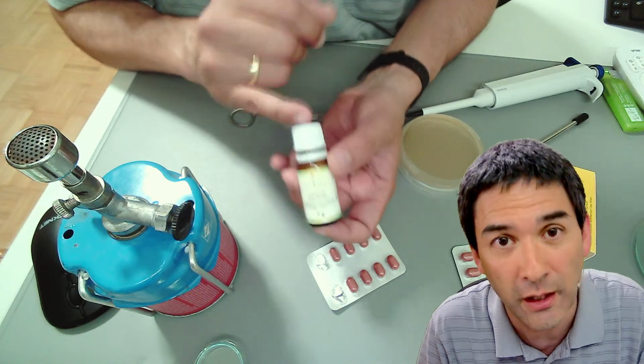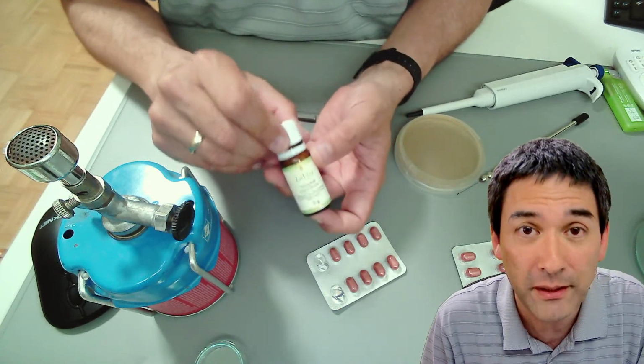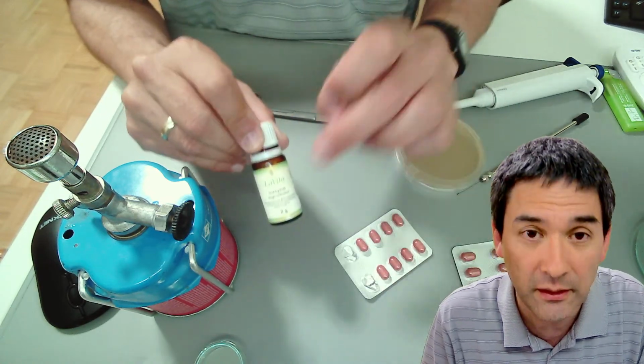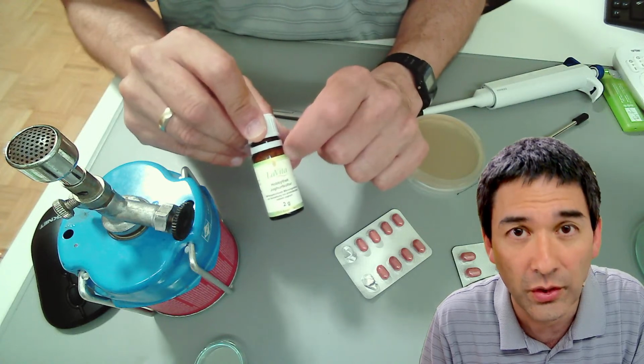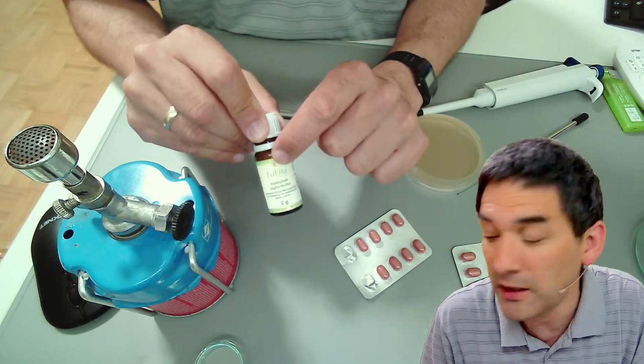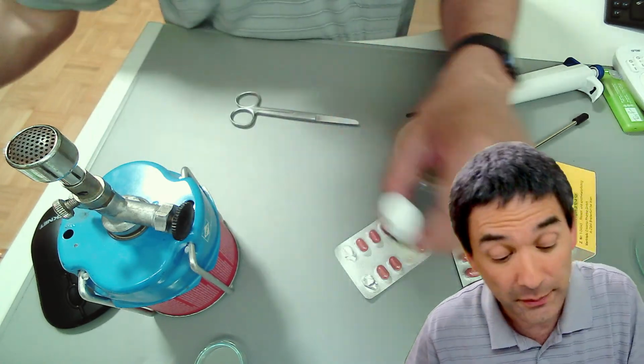Where do you buy this one? I also got it over Amazon. So you can buy freeze-dried bacteria, safe ones like the one over here, which you're able to eat. These are actually, I think, 2 or 3 different strains, bacterial species mixed together to make yogurt. So this is also readily available.